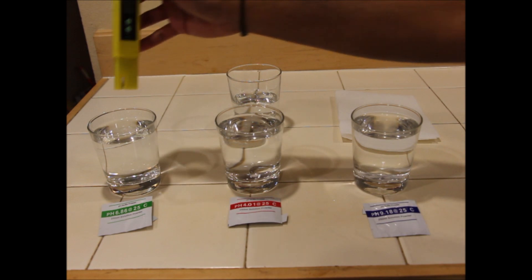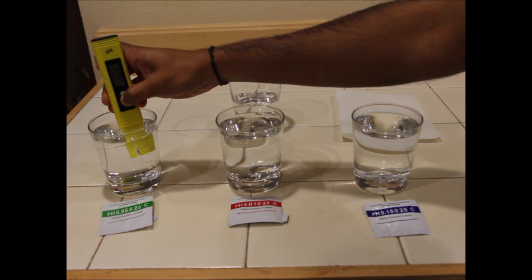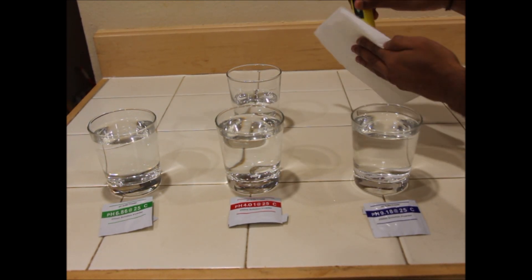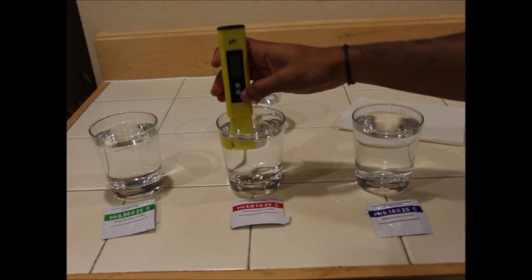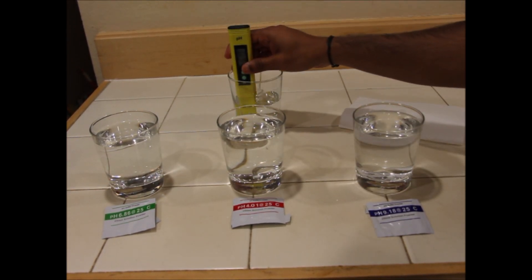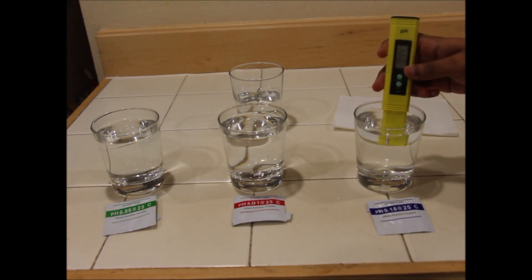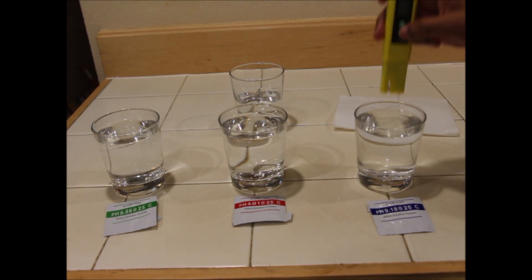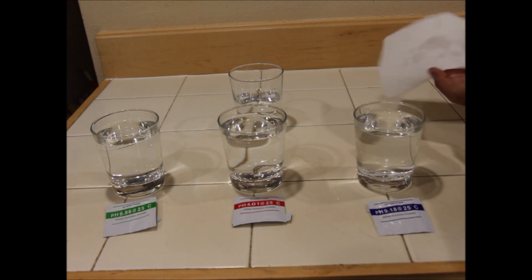Turn on the pH meter and immerse it in the first solution, stir it, and press the calibrate button once. It should read as 6.86 as shown on the packet — this is the neutral solution with a pH value close to 7. Cleanse the meter in the distilled water and pat it dry with tissue. Immerse it in the second solution, stir, and press the calibrate button twice — this should read as 4.01, which is the acidic solution. Cleanse again, then the third solution should record as 9.18, which is the basic solution. Finally cleanse and pat dry.